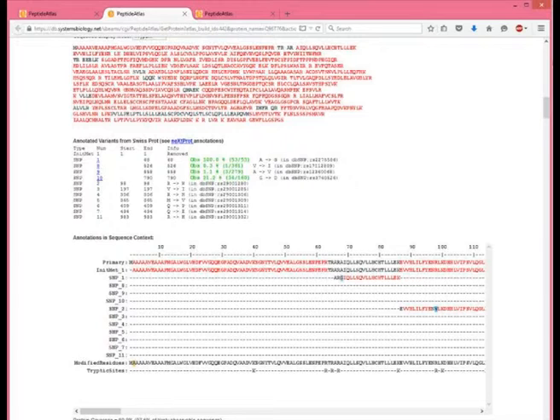This particular protein is interesting because we've seen a number of SNPs. I was talking before about the variant sequences that are in our database. In this case, we've actually seen 4 different SNPs. Some of them we've seen at a very low frequency, 1 out of 360, 3 out of 300. But in this case, we've seen this all 53 times we've seen this peptide. It's been in what was considered the variant form in UniProt. And we've actually submitted these to UniProt and gotten them to switch, essentially, the polarity of the SNP. Because when they were doing the SNPs, they took a number of individuals, identified it, and sort of arbitrarily said, well, this is what should be in the population. And obviously, different populations vary.